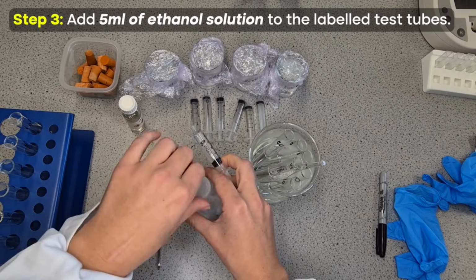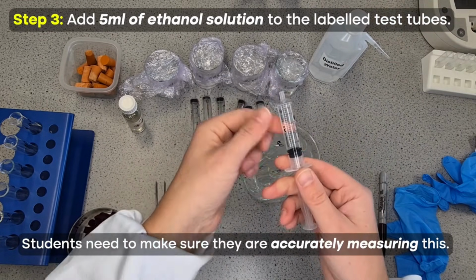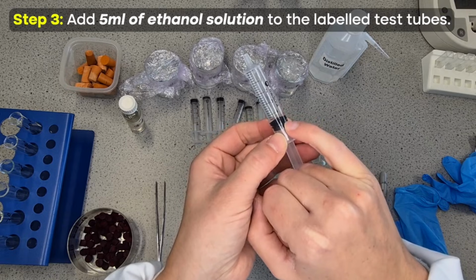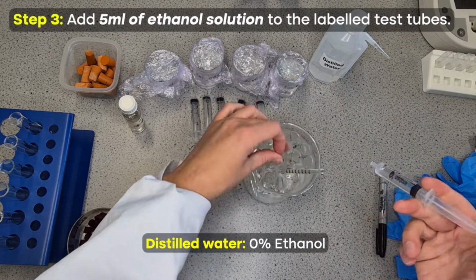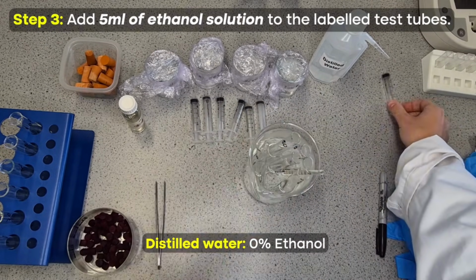One of our control variables was the volume of the solution, so students do need to make sure they are accurately measuring this. So make sure that they know that the bottom of the plunger should be in line with the value. So I can see 5 just here. That is where we should be going to. And this was distilled water, which means 0% ethanol. So that goes to my 0. And I'm going to put that over there so I don't use it again.